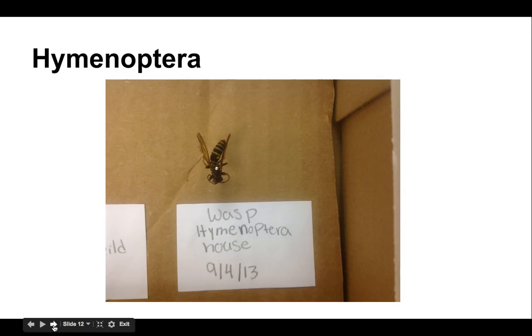And then your hymenoptera — these are your bees, wasps, and ants. These are very common insects and again they are pinned right in the thorax. Most of you will have at least an ant in your collection, and those do get pinned right in the thorax. Since we're doing this in September, we have lots and lots of hymenoptera available to us, so make sure yours is fully dead before you pin it.